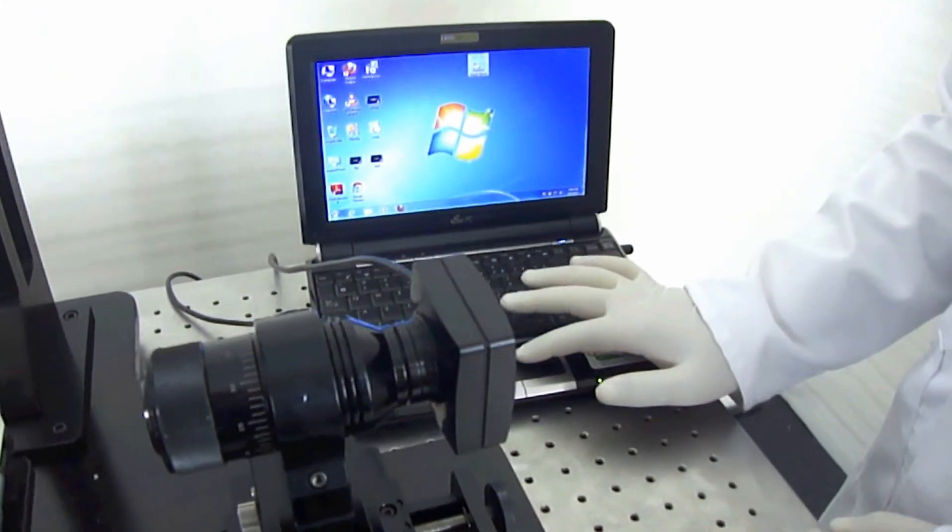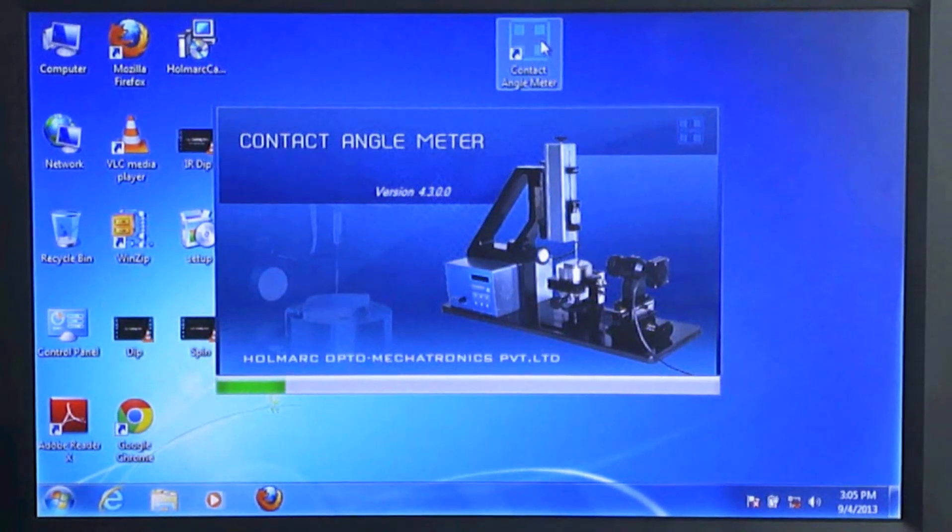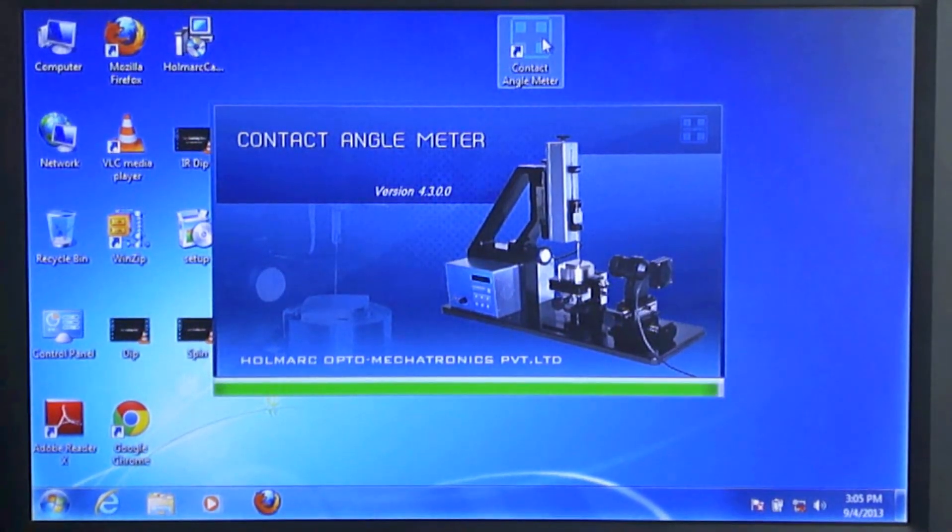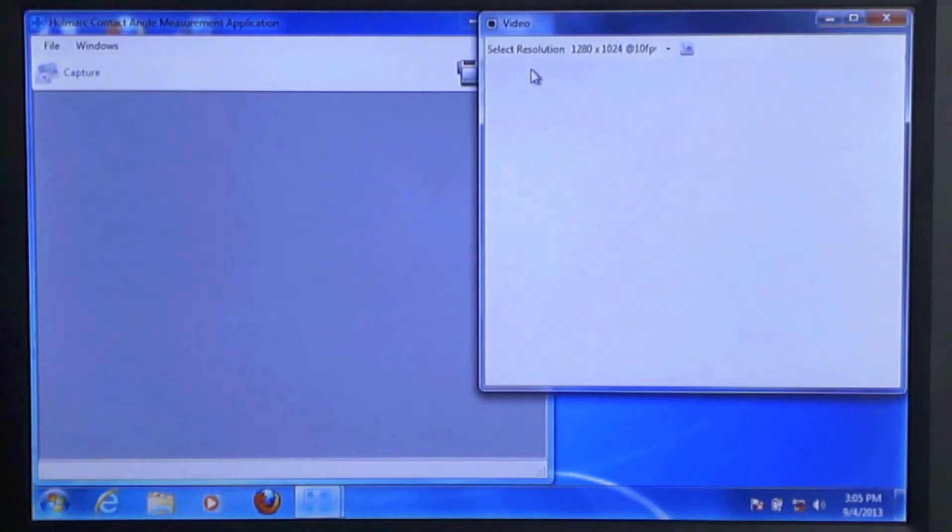Finally, the user-friendly Windows software enables the user to process photos and videos of the droplet to determine its contact angle. Images and the measured angles can be saved by the user for future reference.